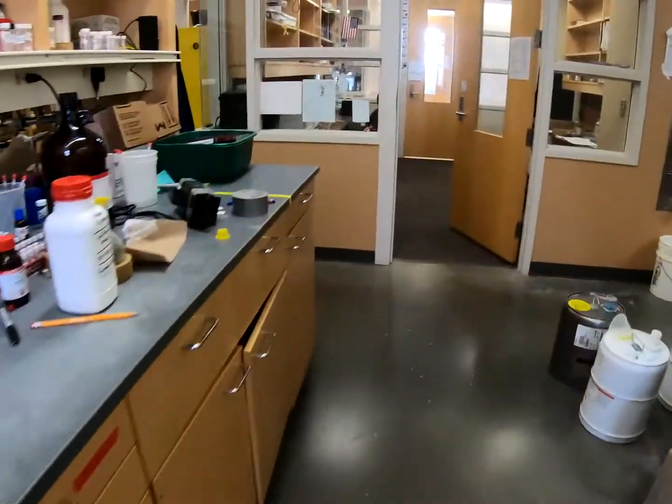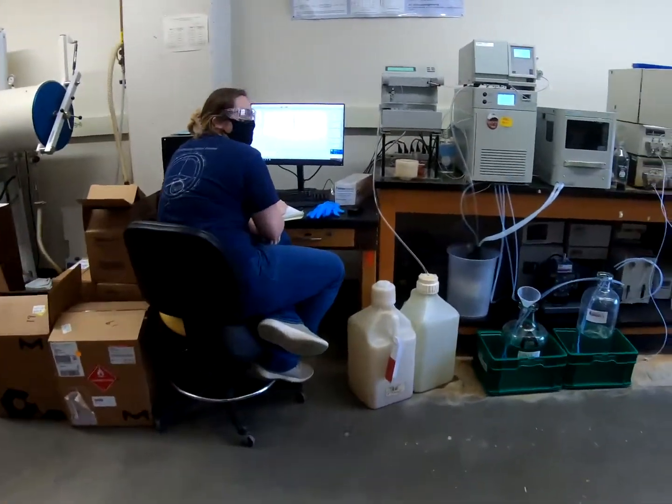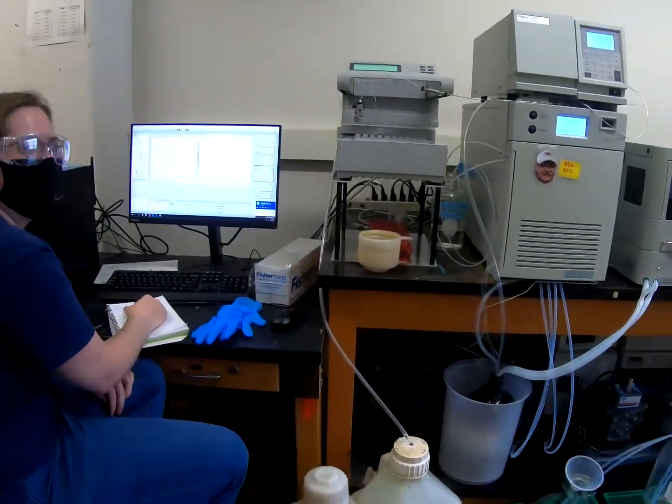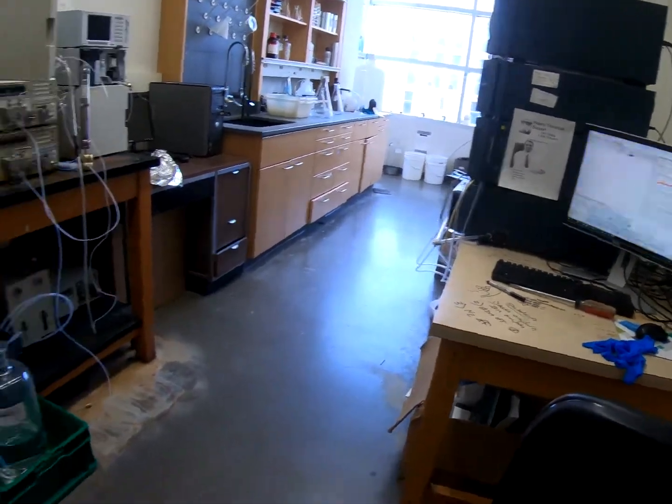All right. And then coming around this corner, we have one of our HPLCs. We've got Big Red and Kate running some samples. Over on the right here, we've got our LCMS.